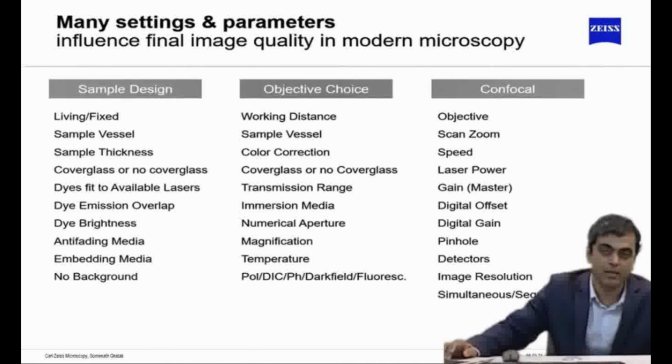But if you want to focus on a single cell, there are always options with the 40x or 63x also. You can zoom in to single cell imaging with very fast scanning, using the laser power optimally, managing the settings for the detector so that you get an optimal signal, and finally using the best detector in case you have a low signal to noise ratio. And for pixelation, from 512 by 512 you can push your boundaries to 1K by 1K, whichever is optimal.